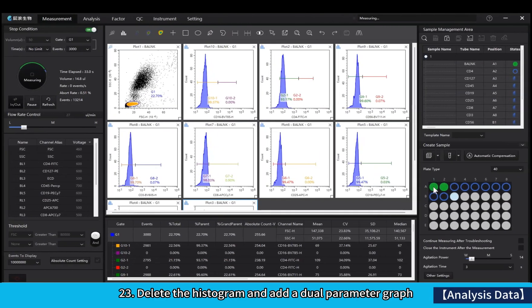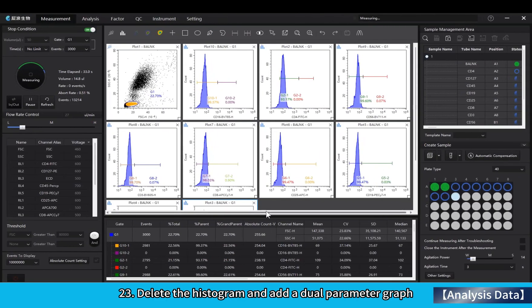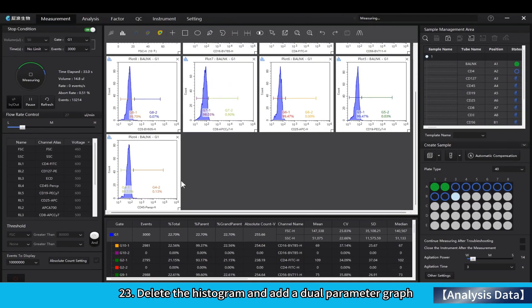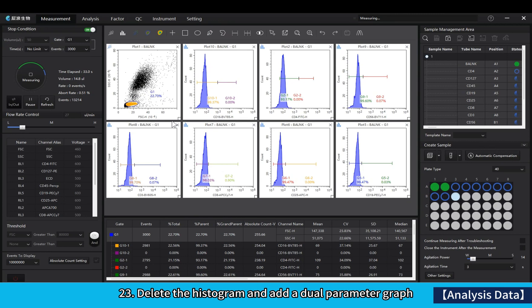Delete the histogram and add a dual parameter graph.